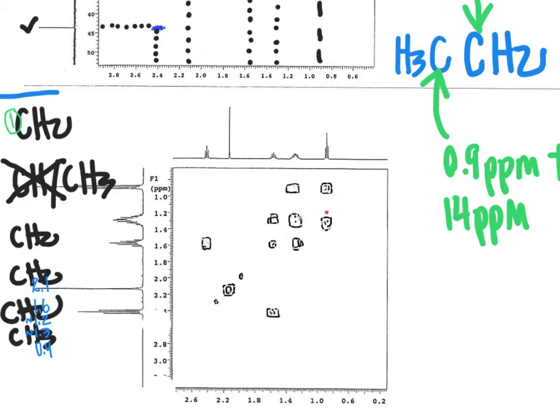And so the important signal is the one down here. So we see that the signal that is at 0.9 ppm, that triplet, the CH3 group that we just looked at, correlates with a proton that is present here at, we will say, 1.3 ppm. So looking back at what proton we have that's at 1.3 ppm, that's what our CH3 group here is going to be bonded to.